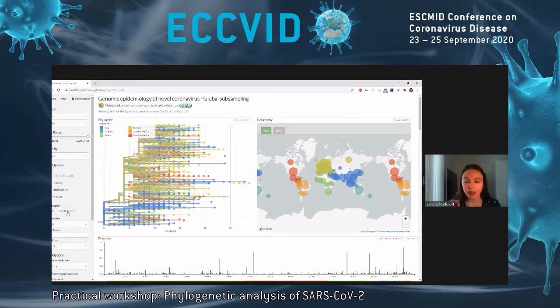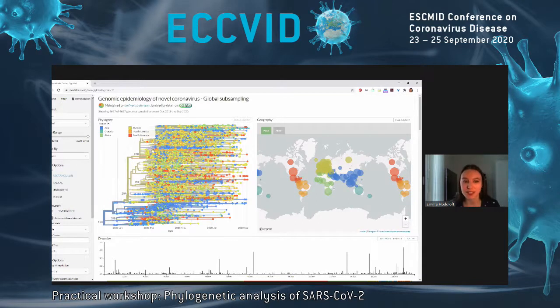We're just very simply saying that these sequences have this many mutations the same and this many different. So it's always good to check this view to make sure that we aren't over-interpreting what we try and infer when we look at the time view, where we have to estimate where sequences are connected back in time. We can do this with different levels of confidence, but it is always an estimate.